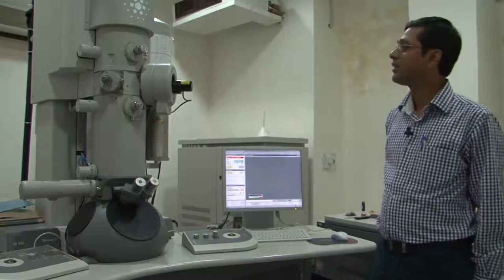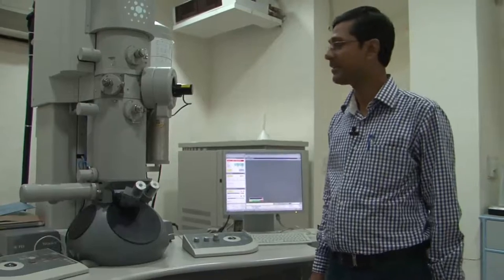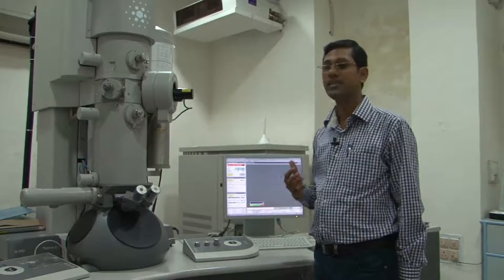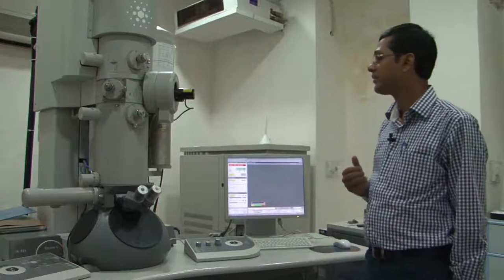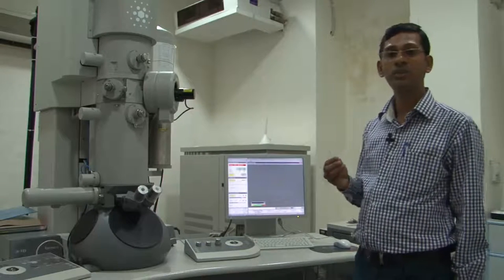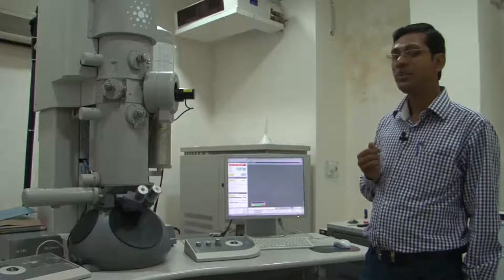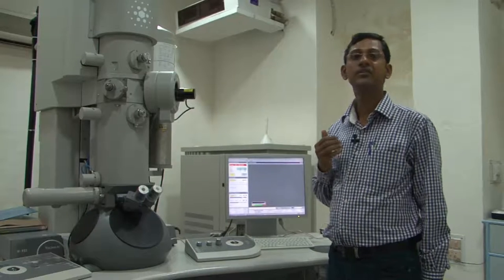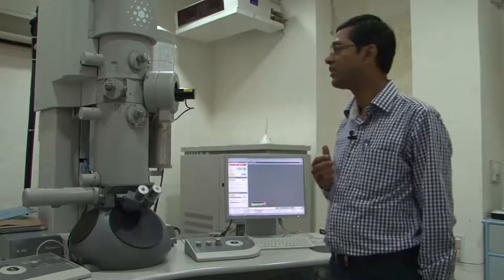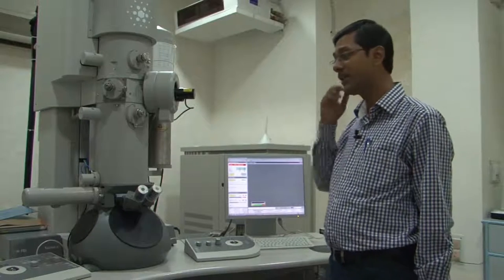A transmission electron microscope is basically a versatile piece of equipment, in the sense that we can use this machine for many analyses of materials and get information starting from diffraction to composition or spectroscopic analysis to high resolution microscopy. So obviously the microscope will have basic features and a lot of attachments to get information on spectroscopic related things and also other aspects, which I will discuss slowly.